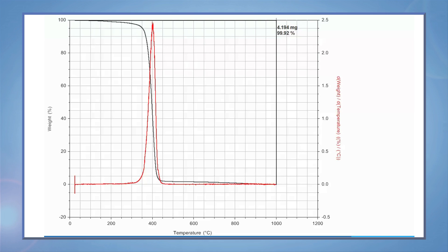In this example, a copolymer of methyl methacrylate butadiene styrene, abbreviated as MBS, is analyzed by TGA mass spec. Examining the TGA mass loss profile and overlaying the derivative curve shows that the mass loss seems to occur in one step at around 400 degrees C.